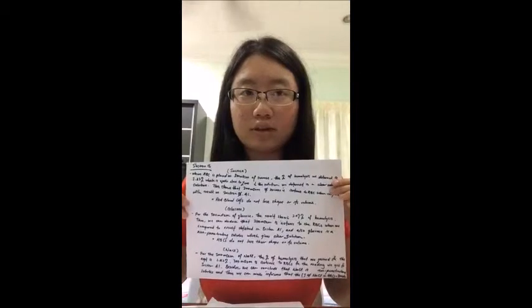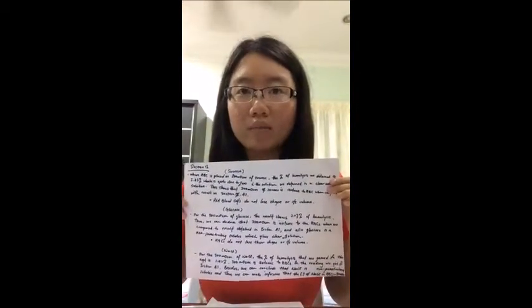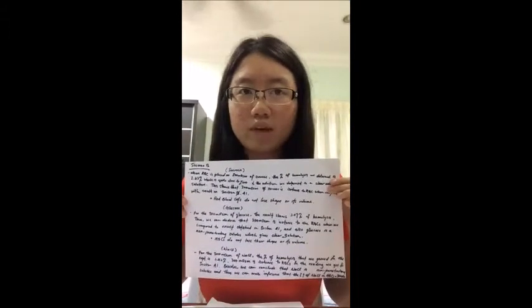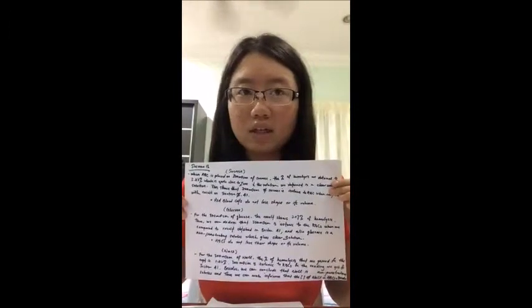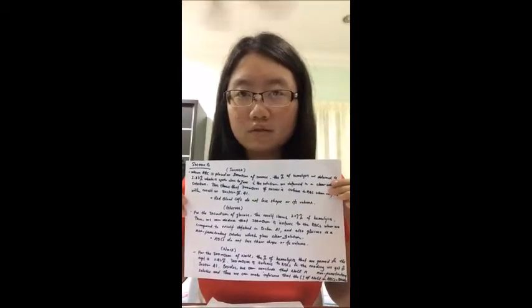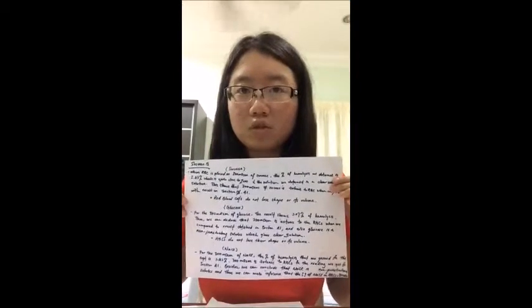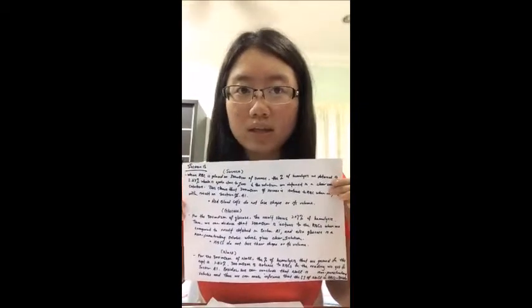This shows that 300 milliosmol of sucrose is isotonic to red blood cells when compared with the results in section A1. The small difference in the percentage of hemolysis may be due to the contaminated surface of the plastic container that we are using for taking the readings from the spectrophotometer, causing inaccuracy of results. Besides, the error could be due to the unclean plastic container which is used to contain the supernatants, and it was used over and over again even after washing.